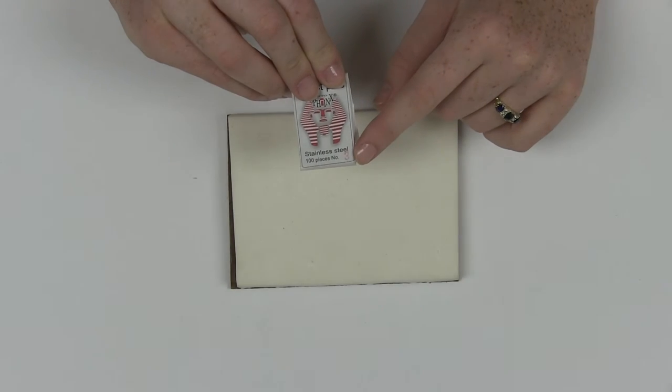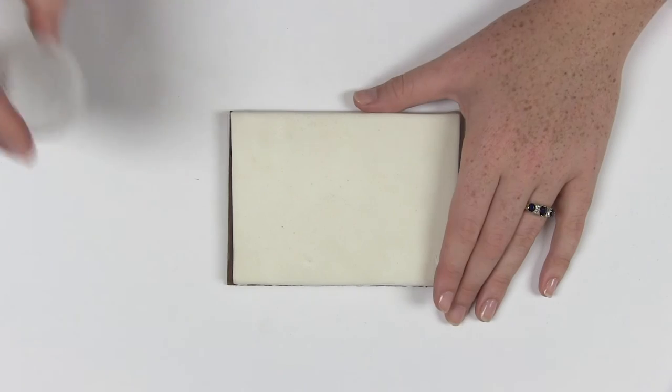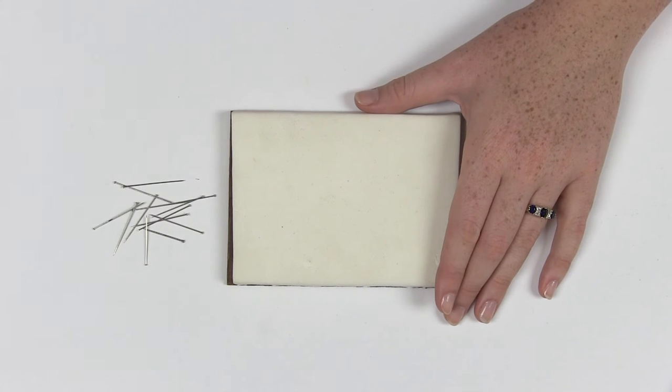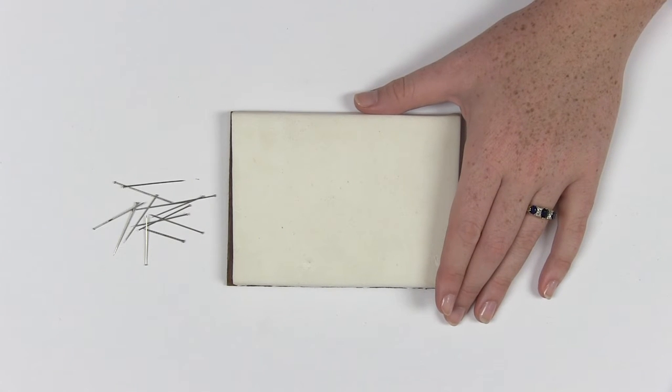To pin a beetle, you will need a foam board, number three insect pins or larger depending on the size of the insect, and some non-insect straight pins to position the body parts for drying.